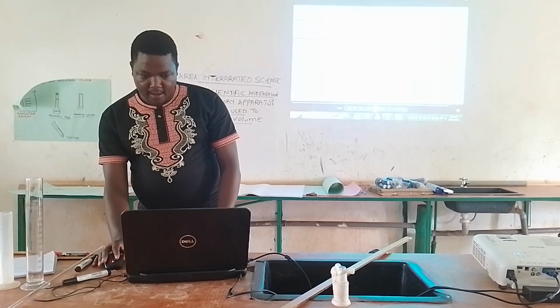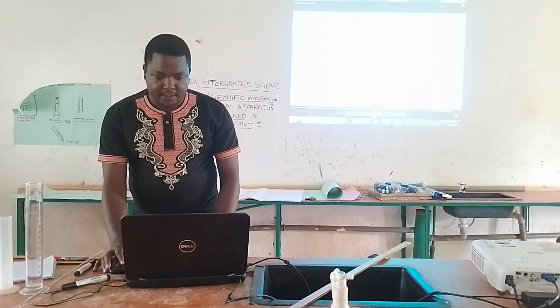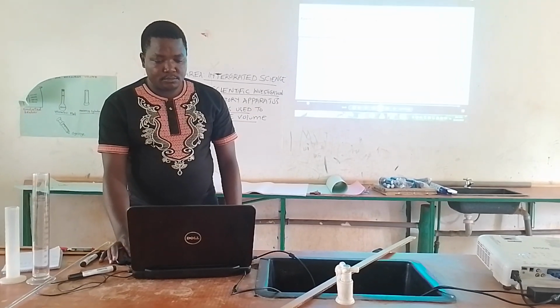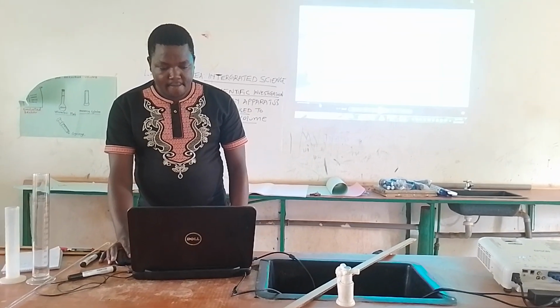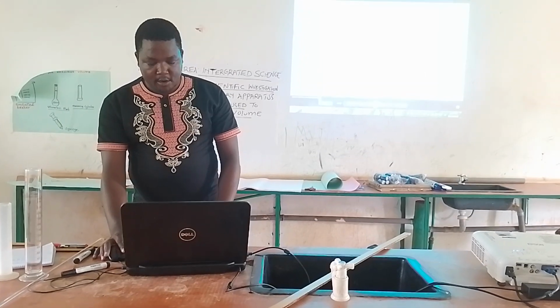Okay, that is a volumetric flask. The beaker. The conical flask.